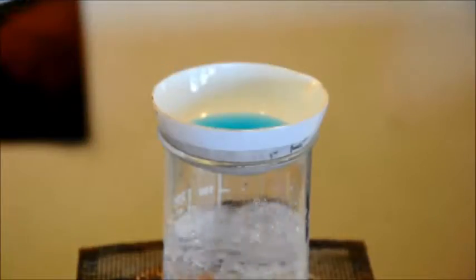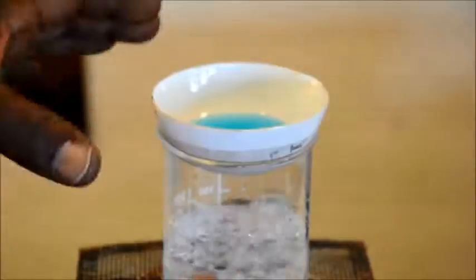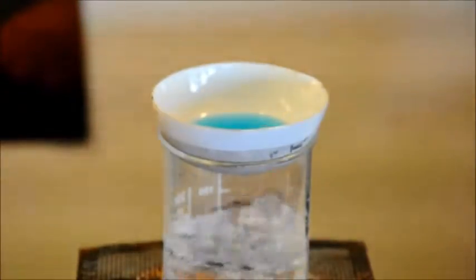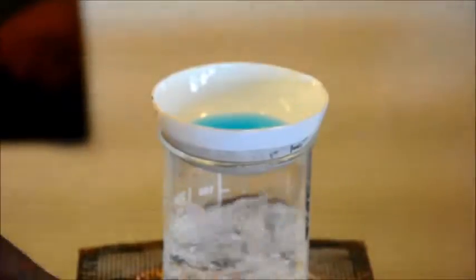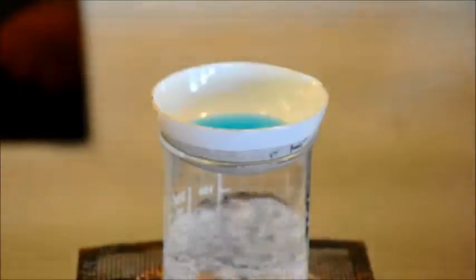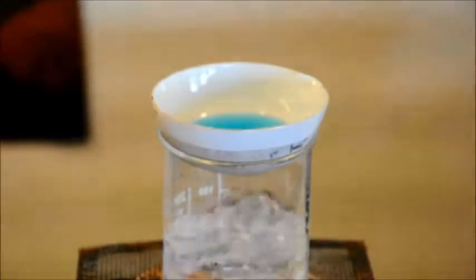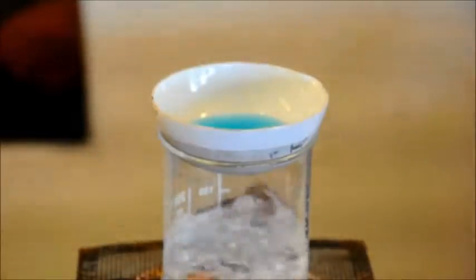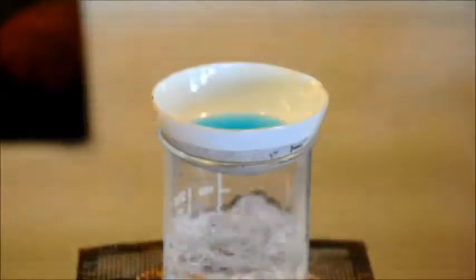The vapor you see here is because of the boiling water, but the heat energy is being transferred to our copper sulfate solution. It's better to do this than to place the evaporating basin directly on the gauze. In that case, there'll be a lot of spitting and it'll be very violent. This is a more controlled way of doing it. We'll just need it to evaporate. Now it's boiling for about another 2 or 3 minutes, and then we'll go to the next stage.